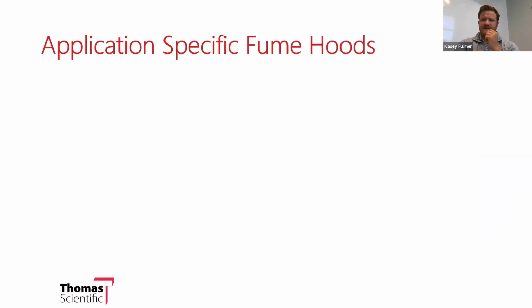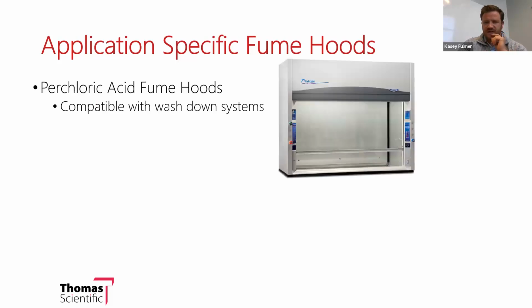And then lastly, I want to talk about application-specific fume hoods. There are fume hoods that are designed specifically for certain processes that are taking place, or more specifically, specific chemicals that are being handled inside of a fume hood. And the first one is perchloric acid. If you have a customer that is using perchloric acid, it requires a special fume hood that is designed to fit on a mechanical system that has a washdown.